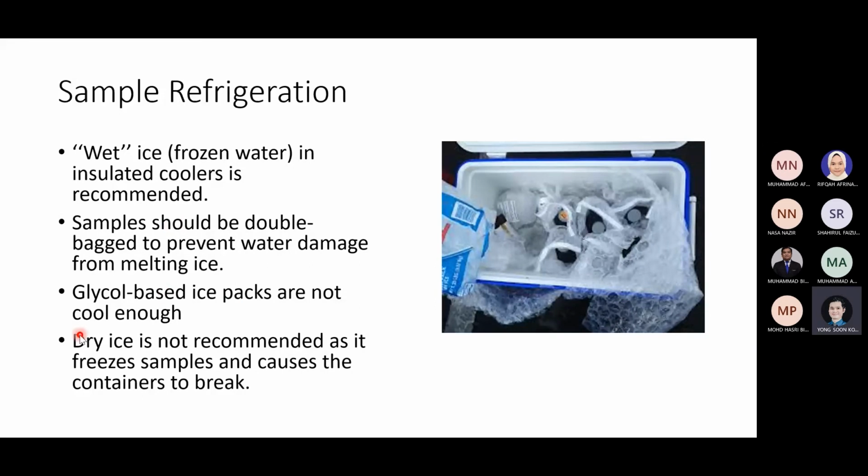Okay, there's another option. Can you use dry ice? Now, dry ice we don't encourage for 2 reasons. Although here they say they don't recommend because they might over ice the sample. Water sample might be frozen and cause breaking, because when water turns to ice, they will expand. So over expansion, they will break the plastic. They also even break the glass, and you don't want that to happen. And also, when you have a frozen water sample, it might change also the characteristic of your water. So that's why we don't even want to ice the sample.